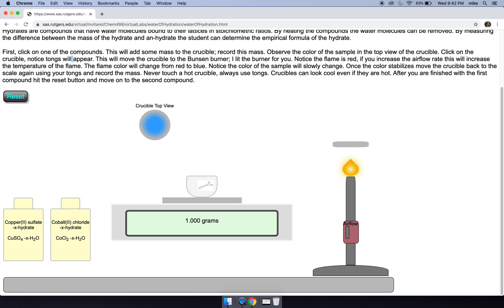When a crucible is hot, it'll still look white, so it can still burn you. So we click on this and the crucible appears here.